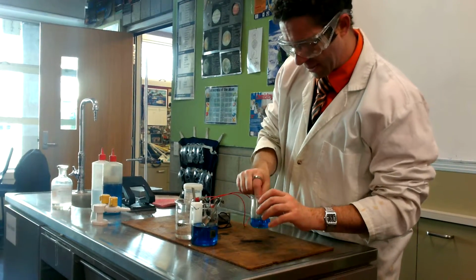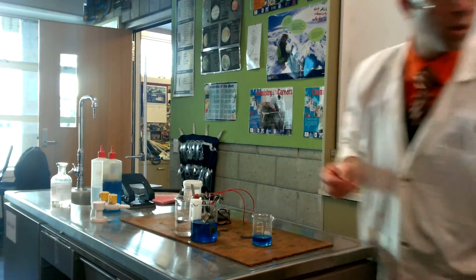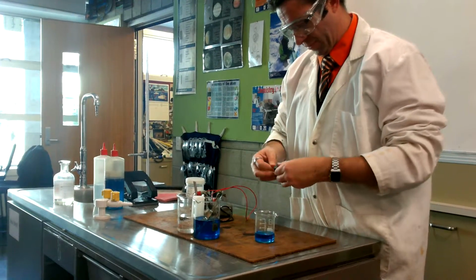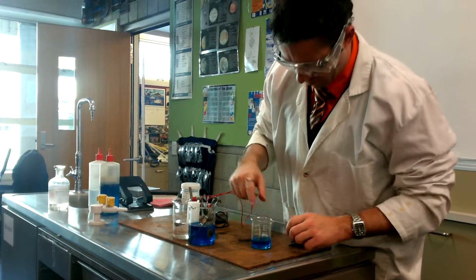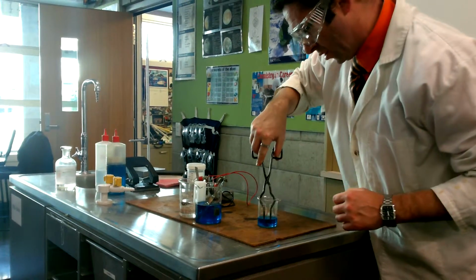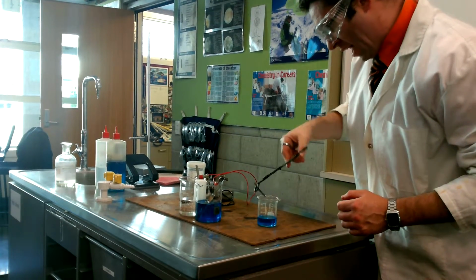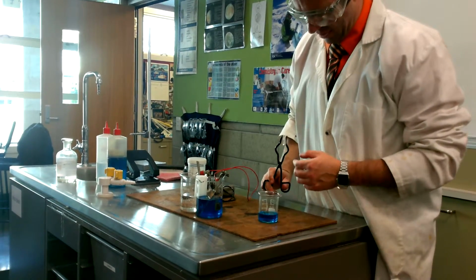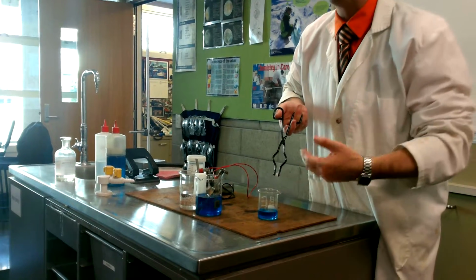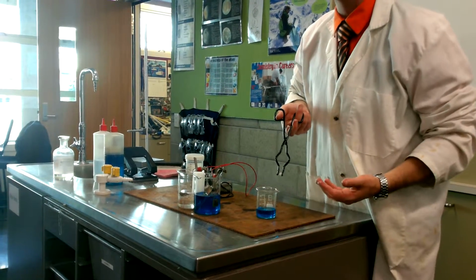Alright, let's see if it's been long enough. Not quite. I'm just going to give it a quick sand, just because there might be an oxide layer there that's stopping this happening. Drop that in there. There we go, good. Okay, so where I have sanded it off, it's starting to go a little bit of a pinkish colour, okay, which is copper forming on there, showing us that it's a spontaneous reaction.